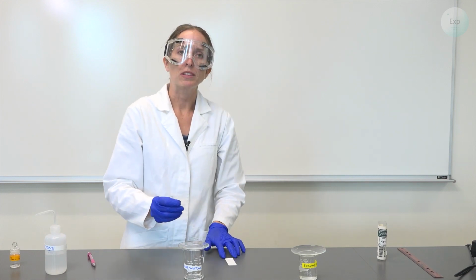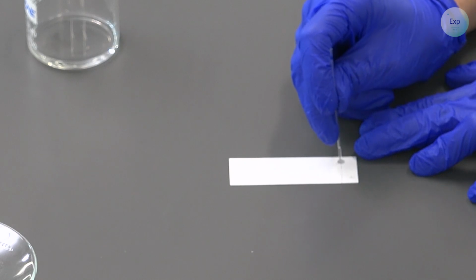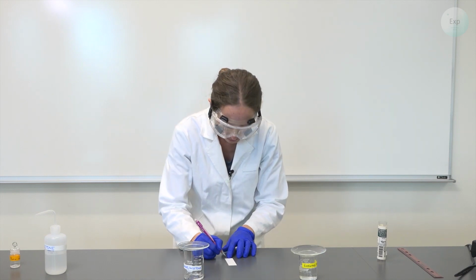Okay, now I am going to spot this on the other side of the TLC plate. And I'm going to label this with a letter C. It was known to be caffeine.